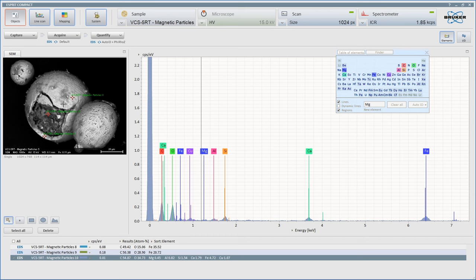Right, so we're going to zoom into this area here and maybe do a map. I'm pretty certain we can conclude that that is an iron oxygen crenellated microsphere. This is the best example we've had of a split one, and then looking into what the guts of one of these structures is. And you can imagine the same sort of thing happening with Alan Goldwater's one, where it's split and we just got a section, a triangular section of it. However, we didn't see the contents. And you can see that the contents is separated.